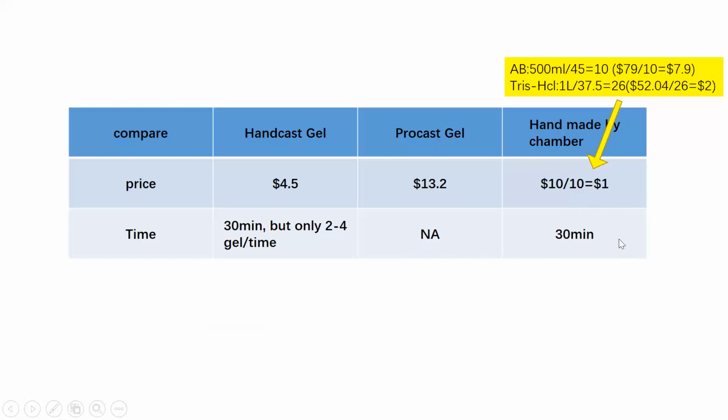And the last was our way, to make it by hand with the chamber. It will cost 30 minutes. I have recorded this time.